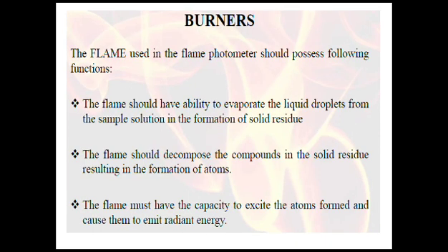Burners. The flame used in a flame photometer should possess the following functions. The flame should have the ability to evaporate the liquid droplets from the sample solution, forming a solid residue. The flame should decompose the compounds in the solid residue, resulting in formation of atoms. The flame must have the capacity to excite the atoms formed and cause them to emit radiant energy.